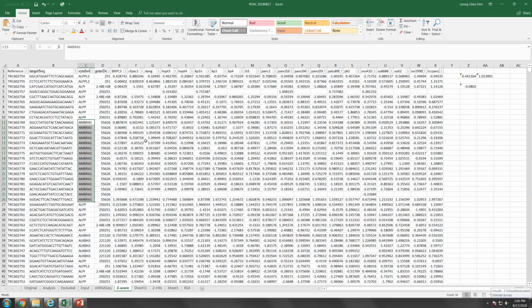One way to do it is to count how many shRNAs that target a particular gene can induce the phenotype that we want. In this case, the phenotype that we want is to reduce cell proliferation, so we are looking for Z-scores that are negative.